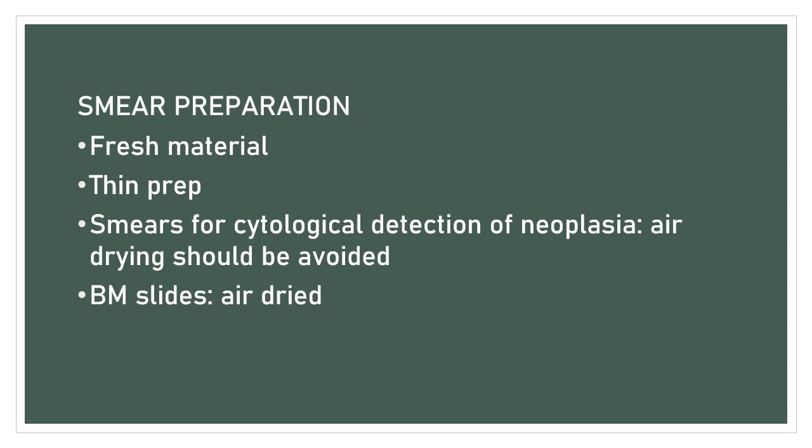For your BM slides, you do it the same as with your preparation of blood films. Right after smearing, you spray fixative, spraying 1 foot away. The smear should be made from fresh material and spread evenly on a clean glass slide.